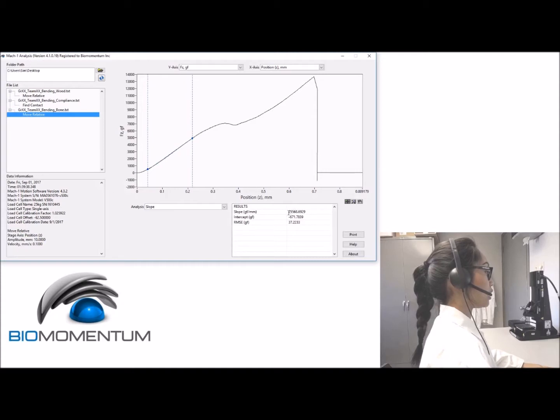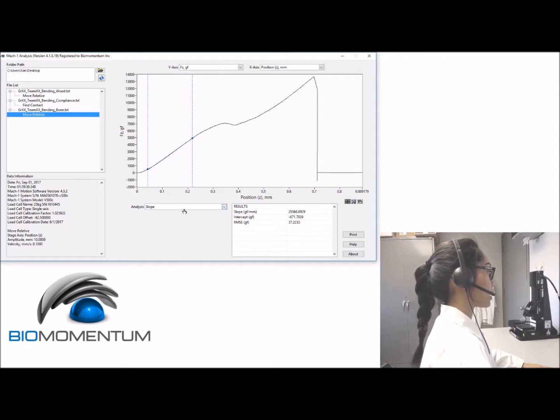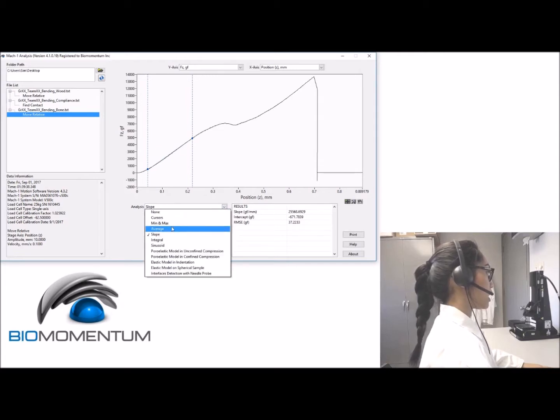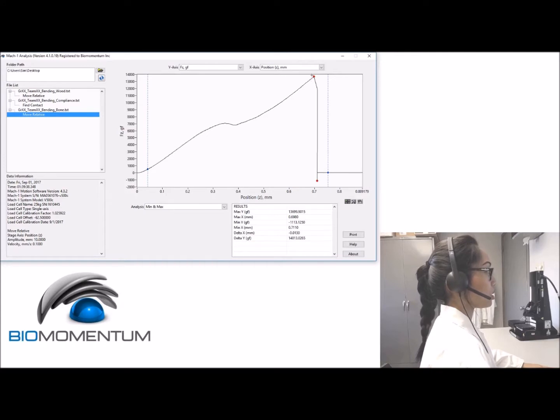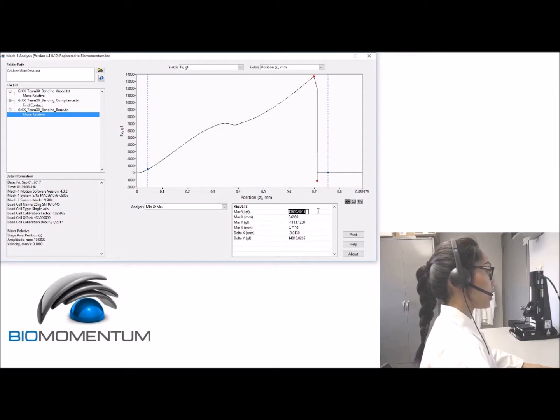Select the linear region of the curve and report the slope as the measured slope. Once again we will obtain the corrected slope considering the setup compliance. Now drag the cursors in a region of interest where the maximum force is needed — the red dot appears and you have your maximum force as the max Y value.